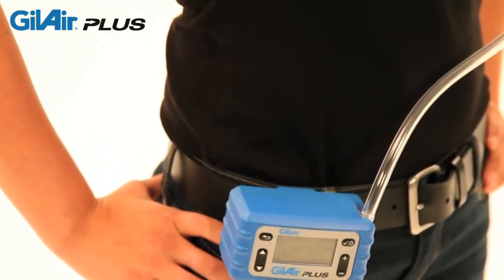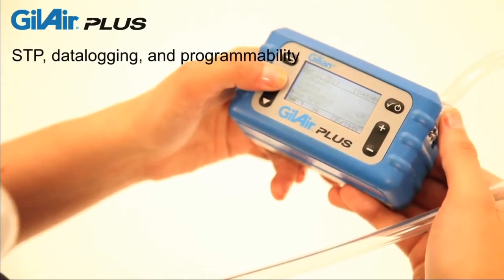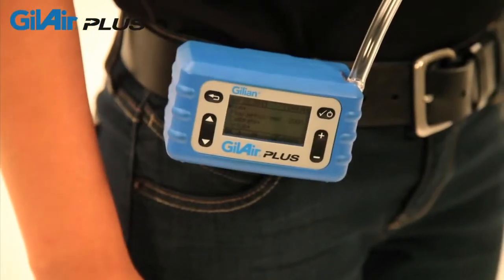For the ultimate in sample integrity, GillAir Plus offers standard temperature and pressure correction, data logging, programmability, a real-time clock, and selectable automatic fault recovery.